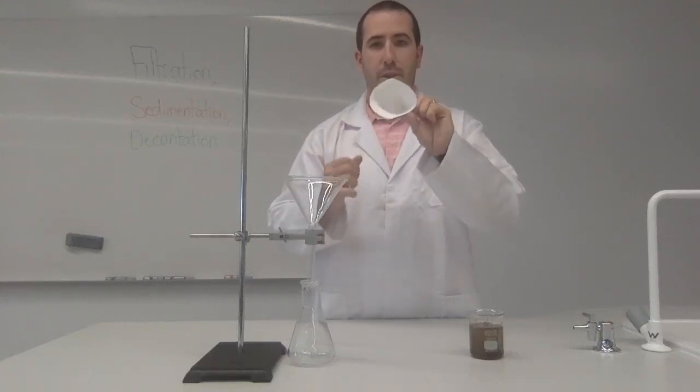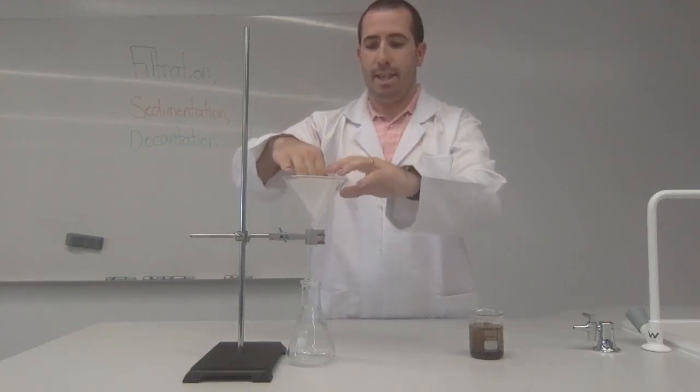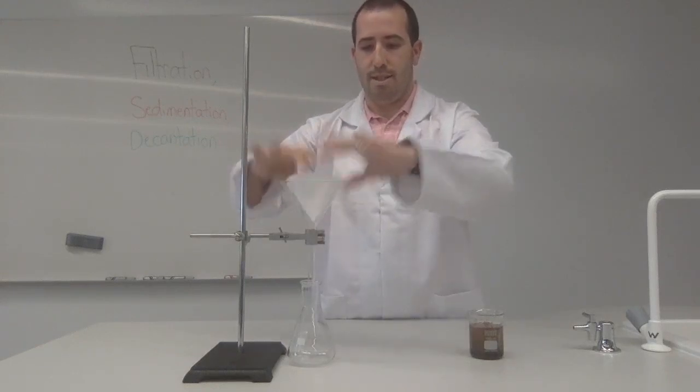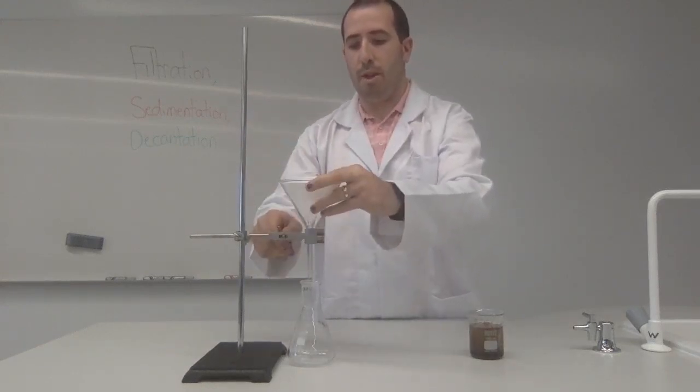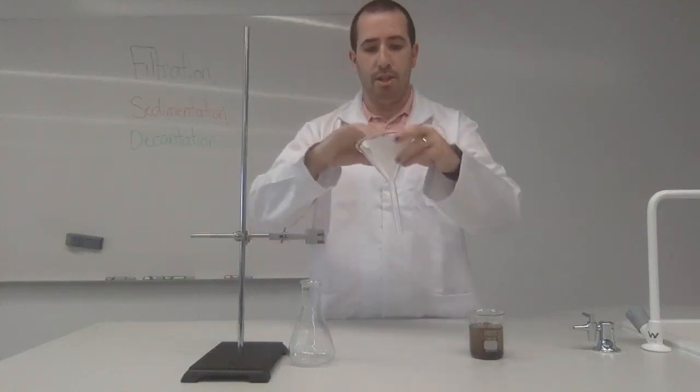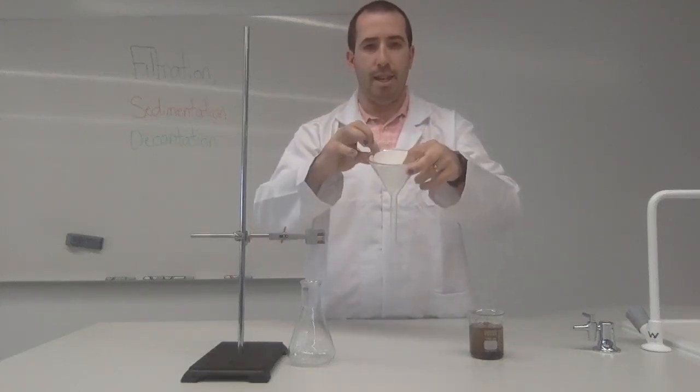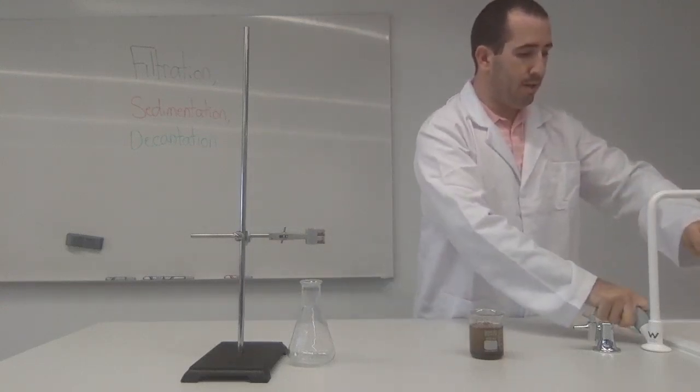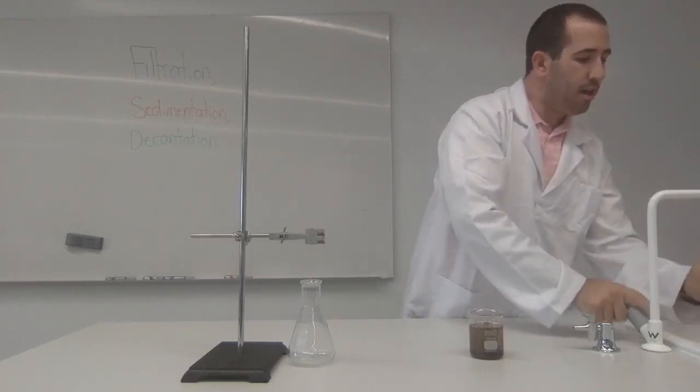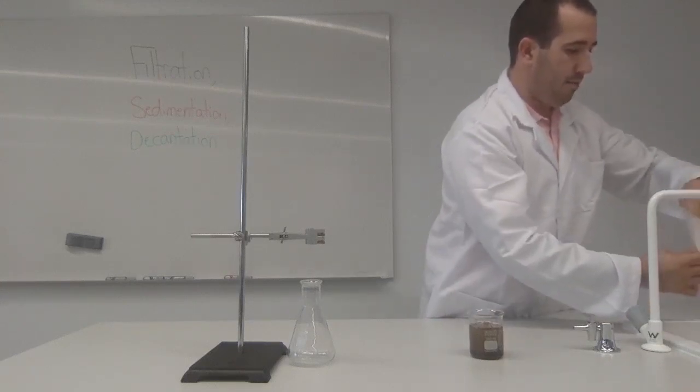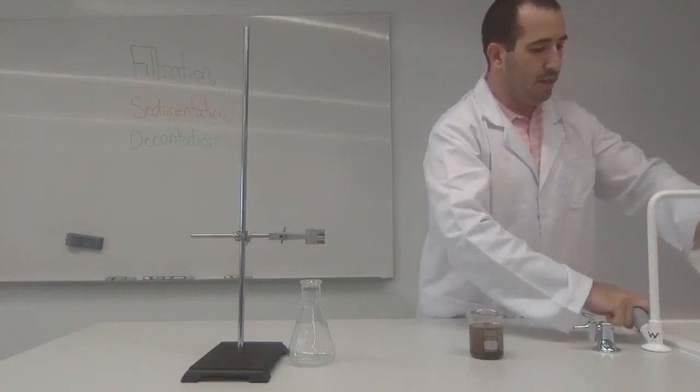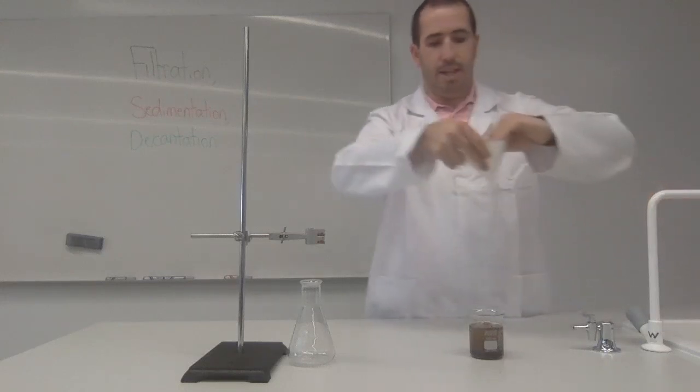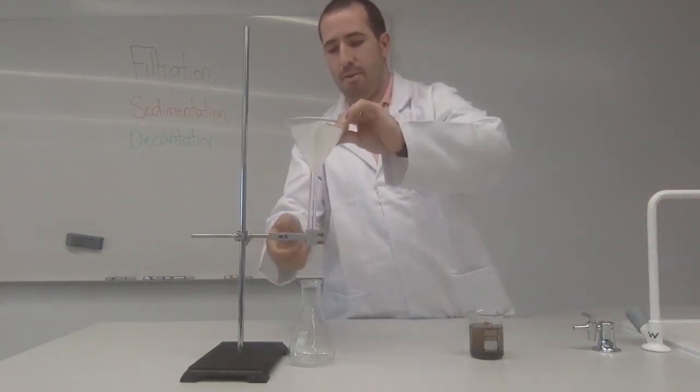Something like ice cream, but now we've got a cone like this, sits into here. Now you realize if it sits in, it keeps popping out. So what we're going to do is just run it through a little bit of water just to adhere the filter paper to the glass so that any liquids cannot get outside of this process. So there we go. Just a bit of moisture just adheres it to the glass surface. That was nice and stuck there. There we go. Ready to go.